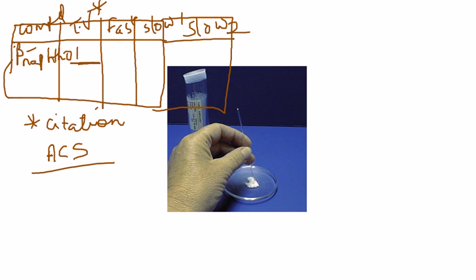Let's say the first sample you took was beta-naphthol. You find the true value, and you run the fast reading. That's the crude reading, for which I told you to set it around 6 to 7, so you get a ballpark estimate of the temperature. What you're then going to do is slow it down and do a slow reading for the same compound.